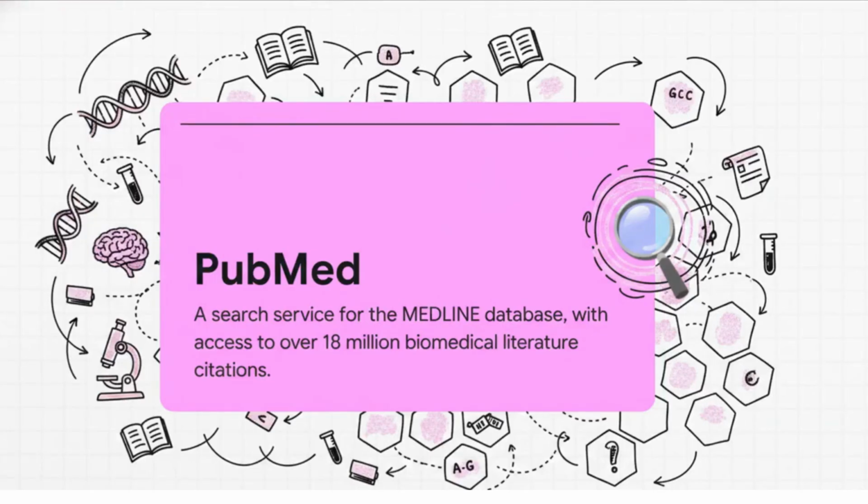And then, of course, you've got PubMed. This is basically NCBI's superpowered search engine for the Medline database, which means you get access to literally millions of scientific papers. And this is what's so cool about NCBI's whole philosophy. The data, like a DNA sequence, is directly linked to the papers that describe it. It creates this amazing interconnected web of information.